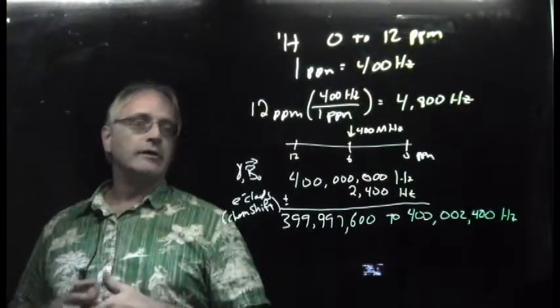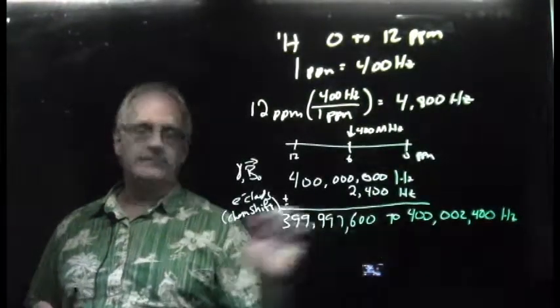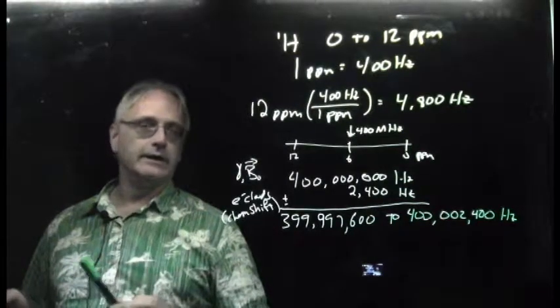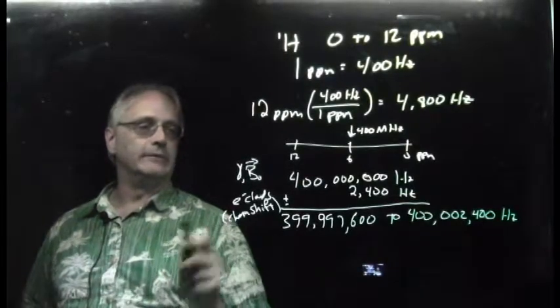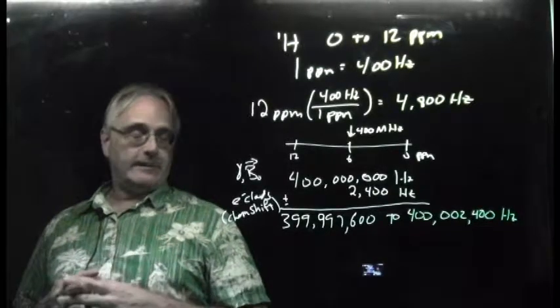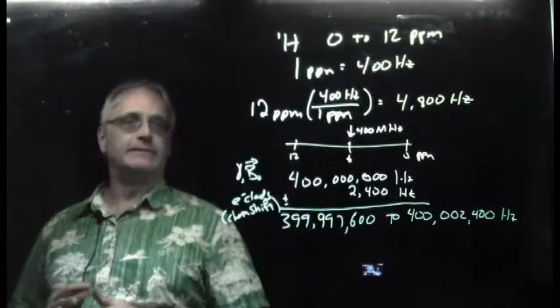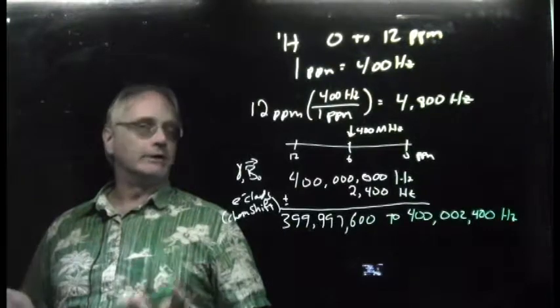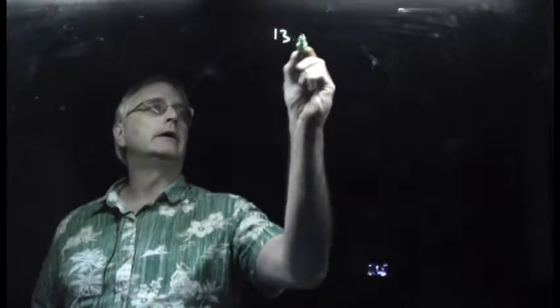They will change their spin states at 400 megahertz plus or minus a little bit. This now is exactly the little bit. It is an effect 1,000,000 times weaker than the influence of the magnetogyric ratio and the big magnetic field. It's a bit of a miracle we can measure it at all, but thankfully we can, and that's what gives us the various chemical shifts we measure and rely upon to tell us about our samples when we do proton NMR spectra.